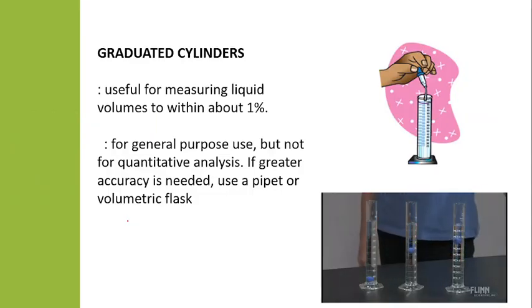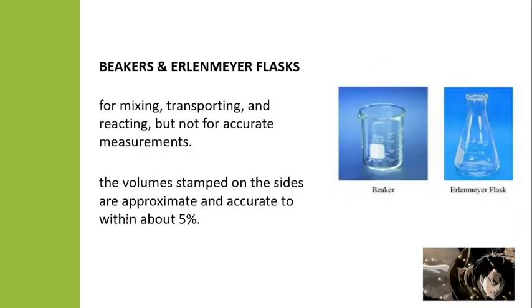Next are your graduated cylinders. It is useful for measuring liquid volumes to within about 1%, for general purpose use, but not for quantitative analysis. If greater accuracy is needed, use a pipette or your volumetric flask.